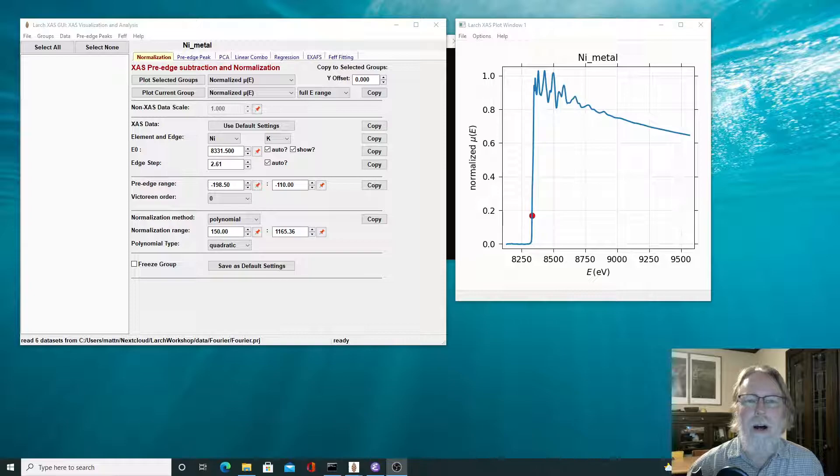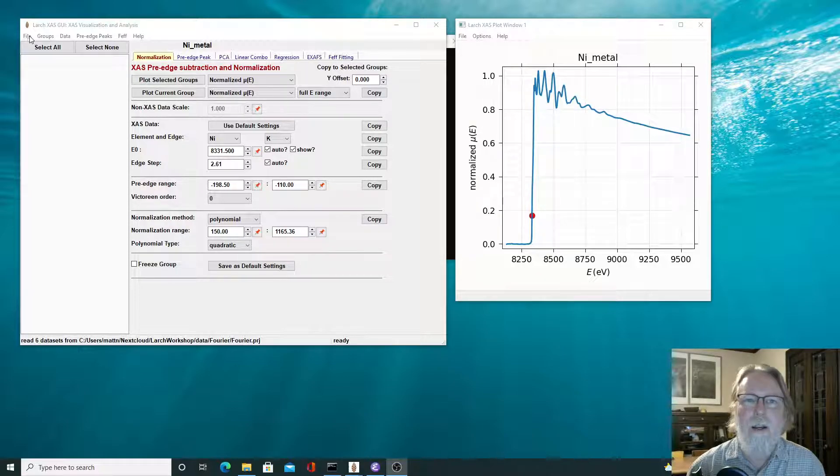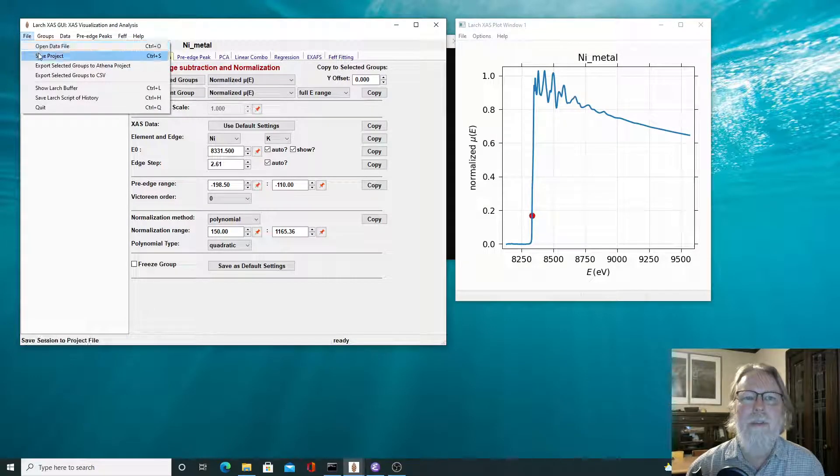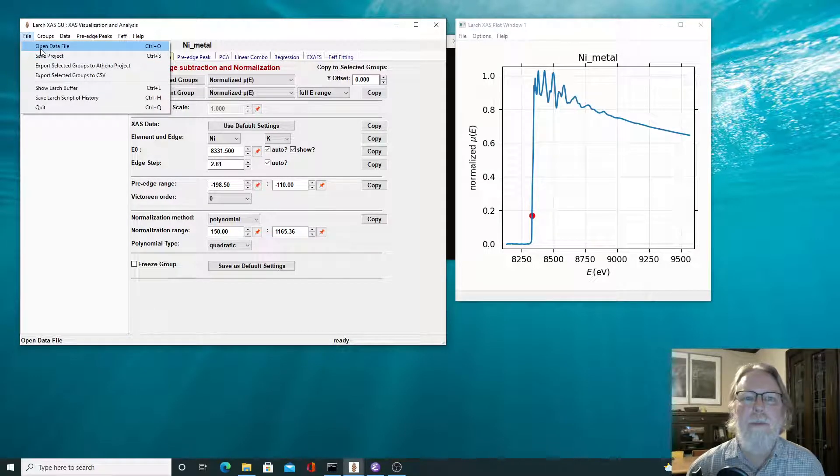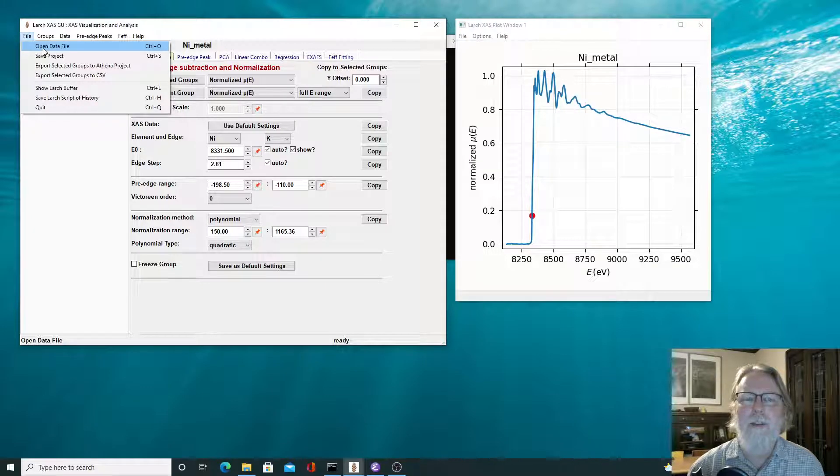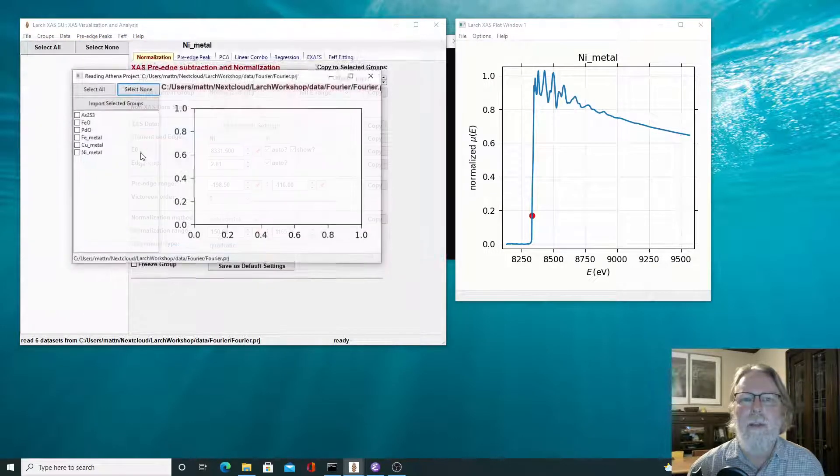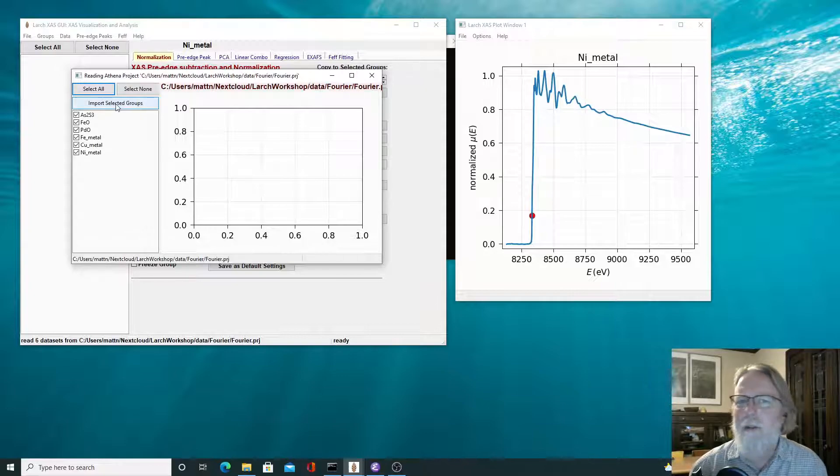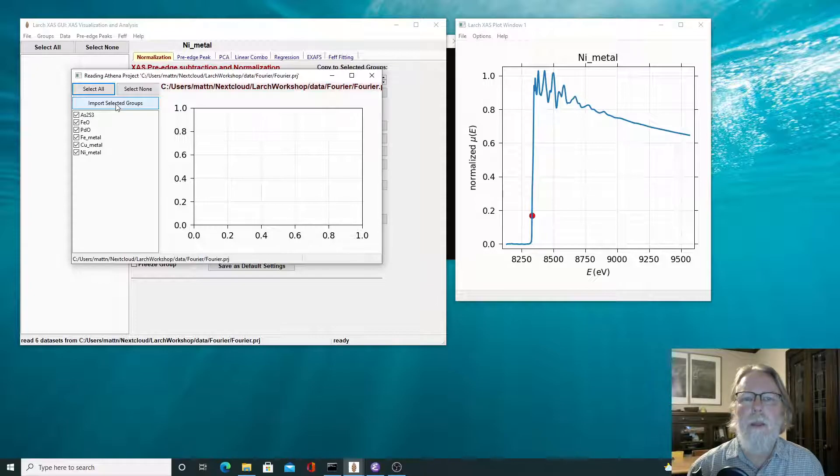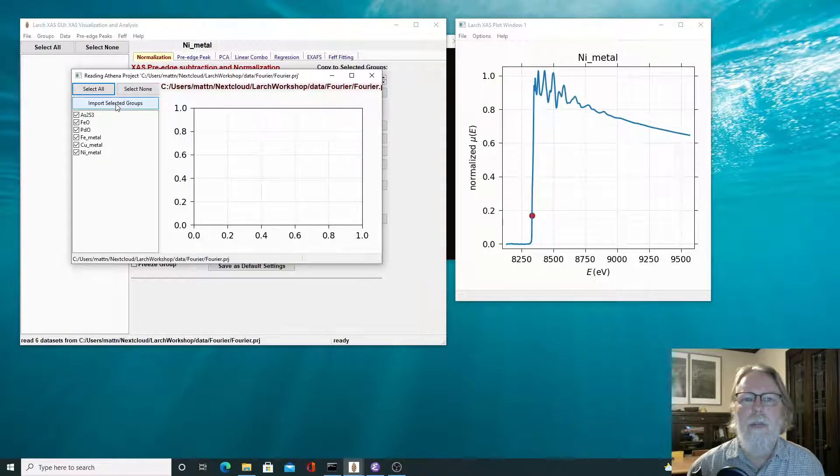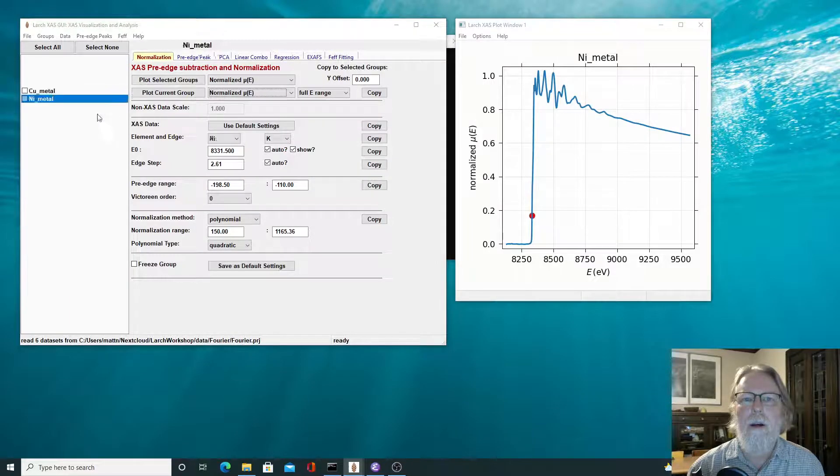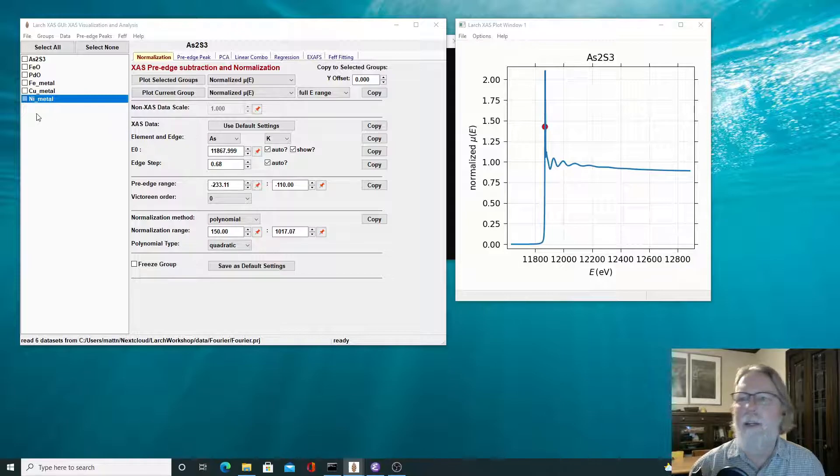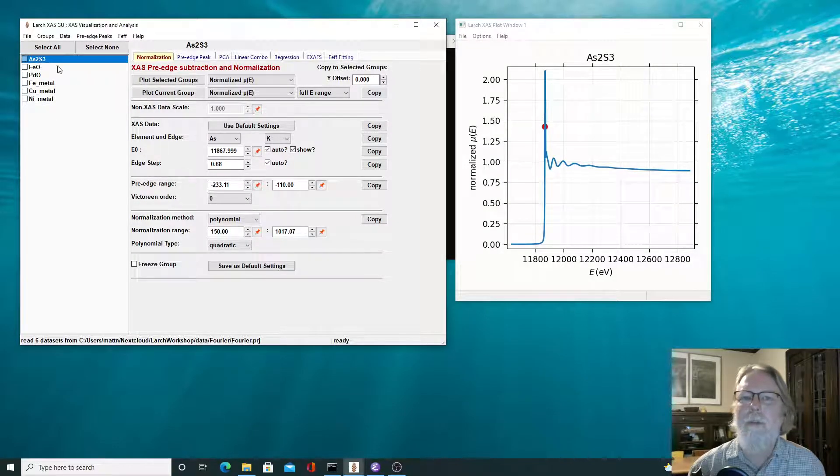So let's start by reading in some XAFS data. I'll read in a bunch of spectra, the same sets that we used in the previous video, just as a variety of XAFS data of various types. So we'll read in this Athena project file. I'll just read in all of these and we'll just do the background subtraction on all of these in this video just to give you an idea of how that works, and then also a little bit on what we see from XAFS data.